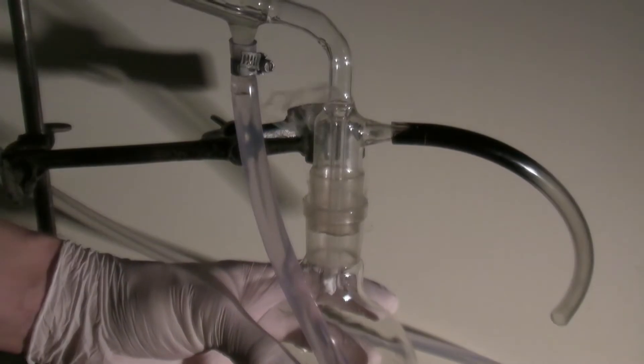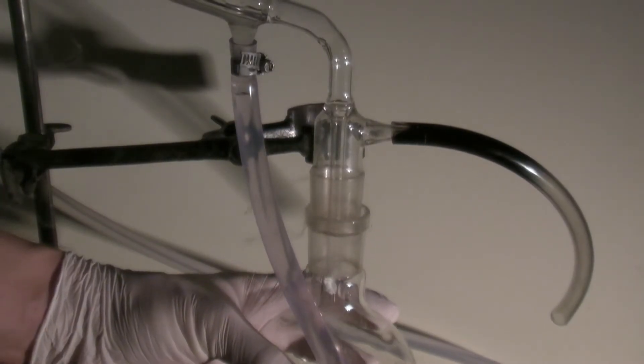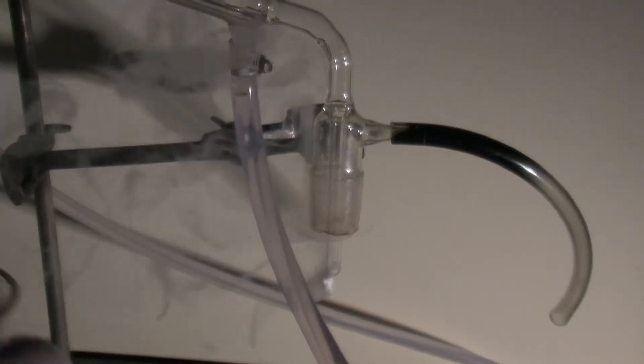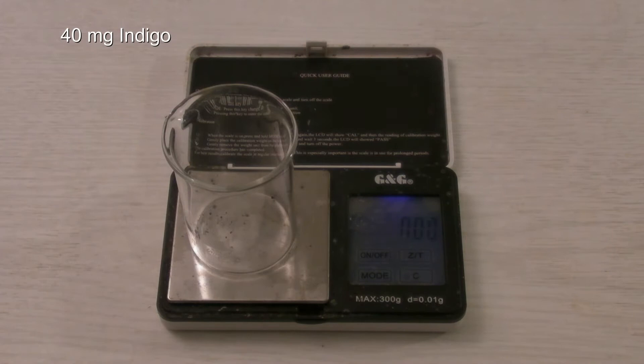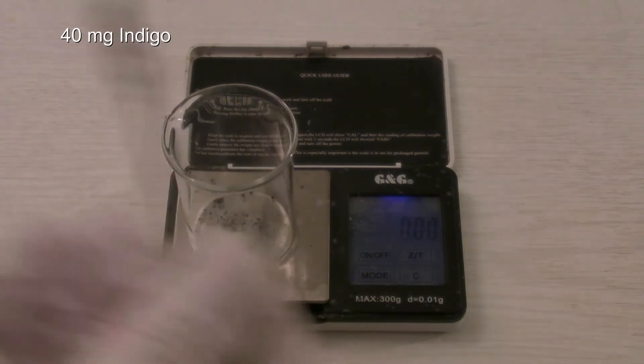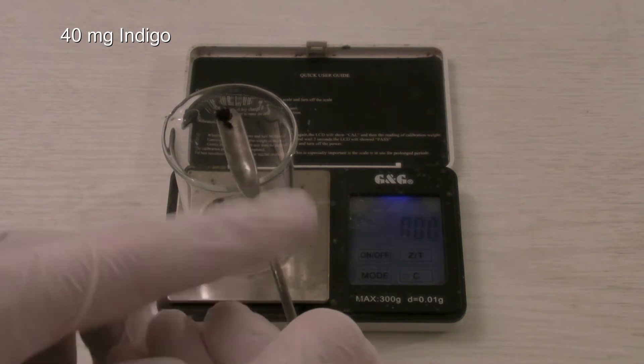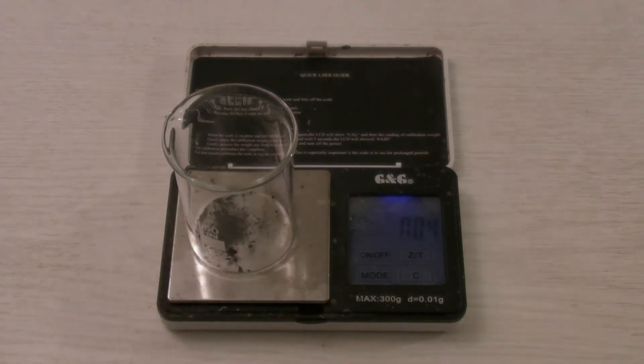Usually, sulfur trioxide is used in the sulfonation, but in this case it is not needed. For the experiment, about 40 milligrams of indigo were weighed out. 20 milligrams would be better. The scale was only able to weigh out up to a tenth of a gram, so a spatula tip of indigo could also be used.